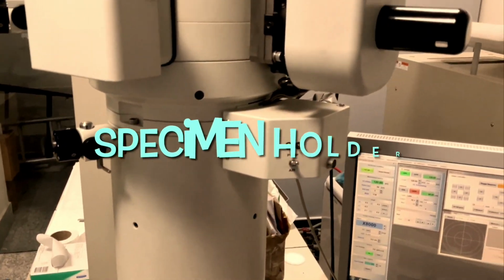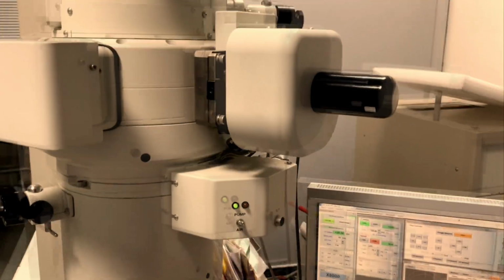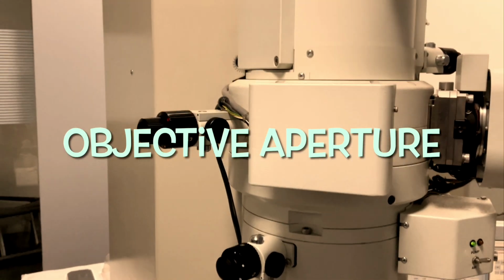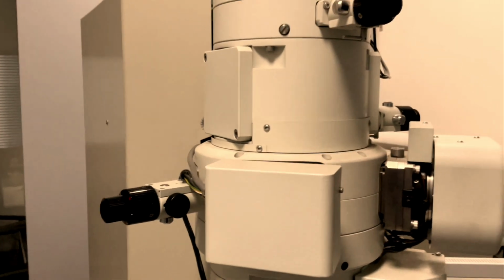This is the specimen holder where we put our sample deposited grids. This is the selected area electron diffraction aperture that helps to get the spot and ring pattern. This is the objective aperture that helps to improve the beam focus and contrast.